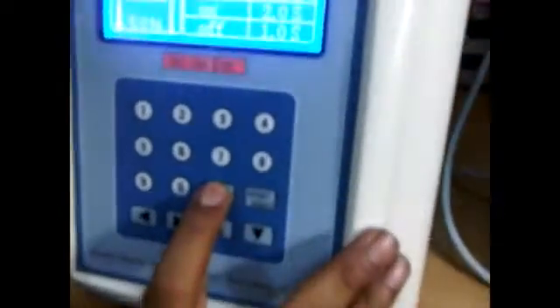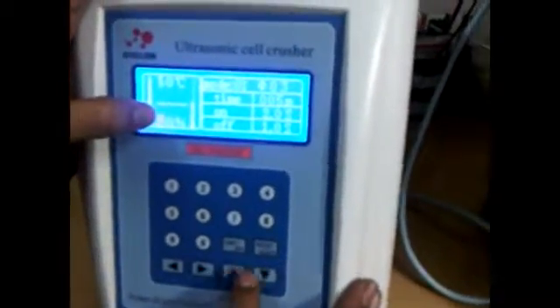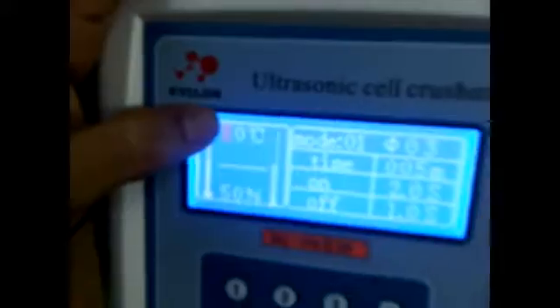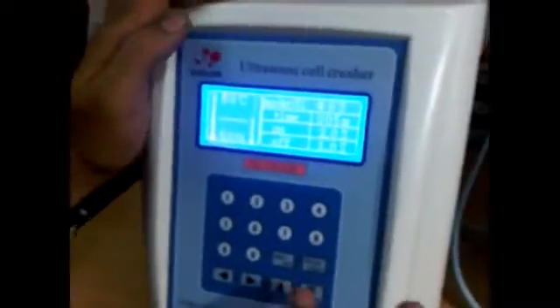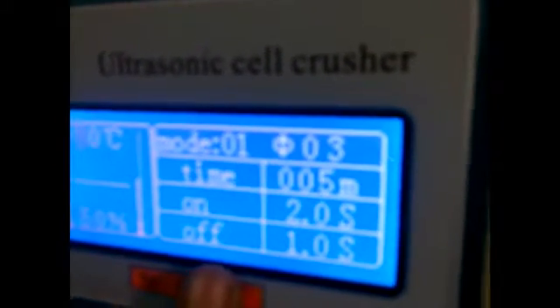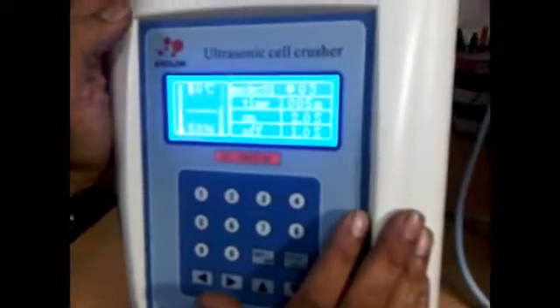Time is this will run for 5 minutes. On is on cycle for 2 seconds. Off is off cycle for 1 second. We can increase and change these parameters if we want to do that. Here this is the power at 50 percent. This is the temperature at 50 degrees, so during the run if the temperature shoots above 50 degrees, the machine will stop. One important point is that the on cycle should not be more than 6 seconds continuously, and there has to be one off cycle of one second or more. One more important point is that for 2 and 3mm probes, the minimum power should be 30 percent. And if we are using 95 percent power, then it should not be for a very long time, otherwise it may damage the probe.